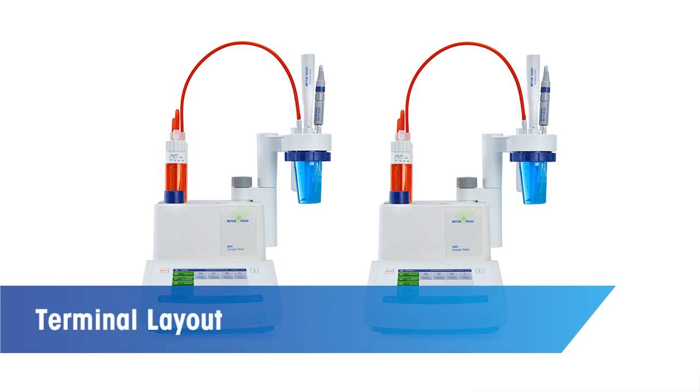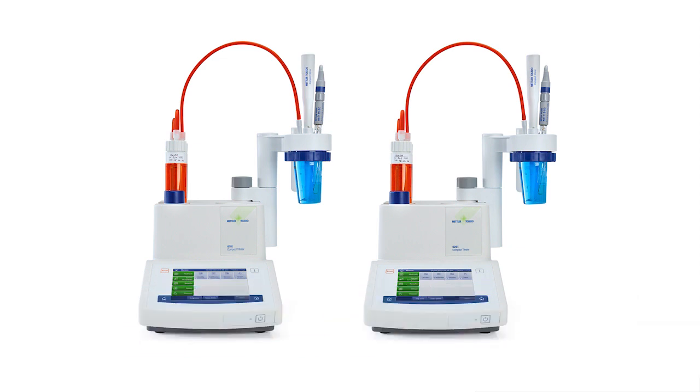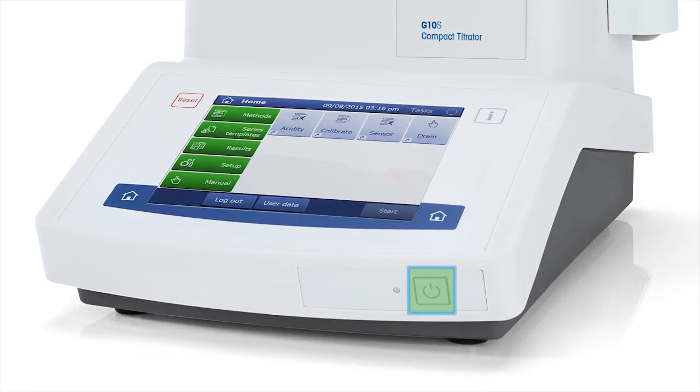The first thing we'll do is get to know the layout of the titrator's terminal. The power button is located here on the front of the instrument. Pressing the Info button accesses interactive online help for the content of the dialog that is currently on the screen. The Home button returns the user to the home screen from any menu position, even while tasks are running, and the Reset button ends any current tasks.